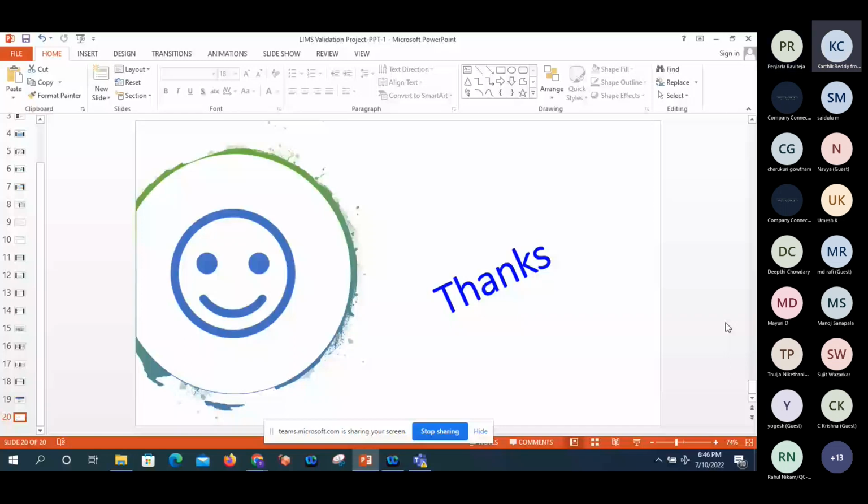No. See, we don't have any application, and it's very critical to get the application from outside. So we will explain the life cycle approach for LIMS validation. In some of the slides, I will take some things from Google and introduce them here in the PPT.